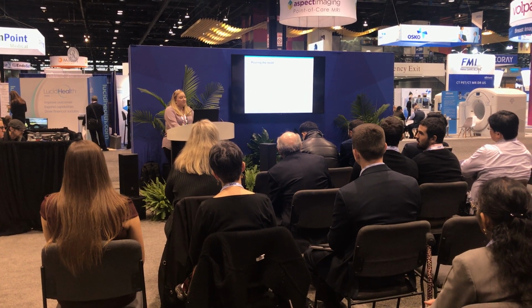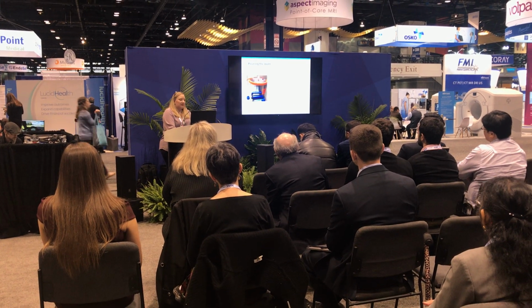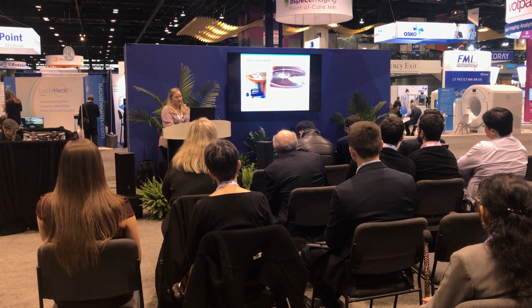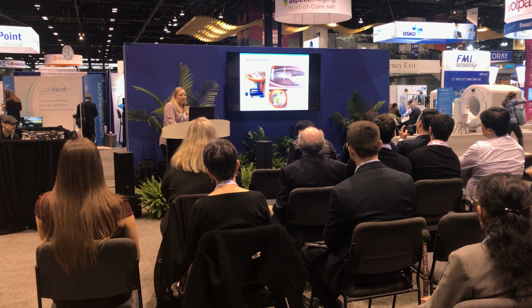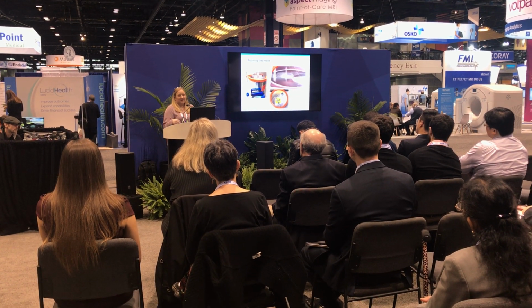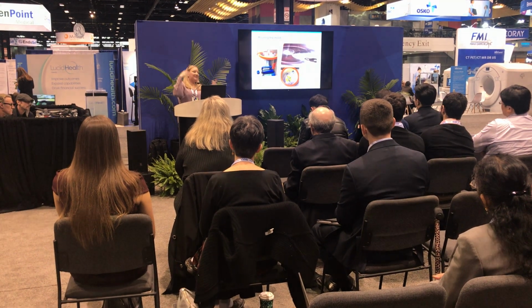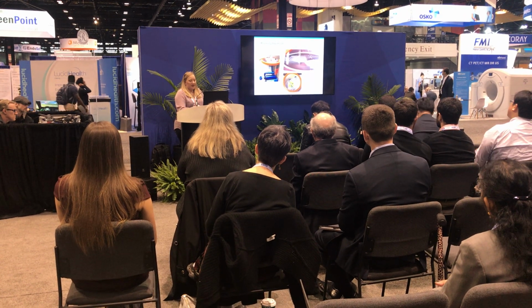A really important step in any of these simulation models is degassing. You have to use a vacuum chamber and vacuum pump. This is just showing it going here. The big thing to remember when you're degassing is to not fill your containers. Don't even fill them halfway, because you're gonna have a huge mess. Anytime you degas, the level rises, so I try to go up to about below half.